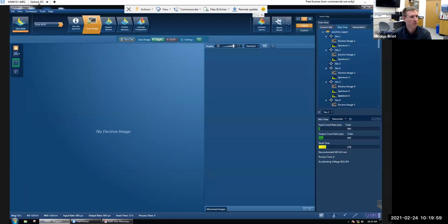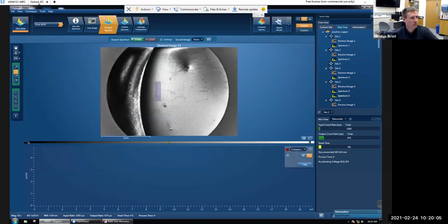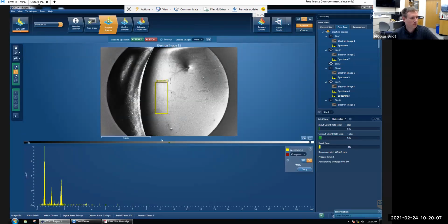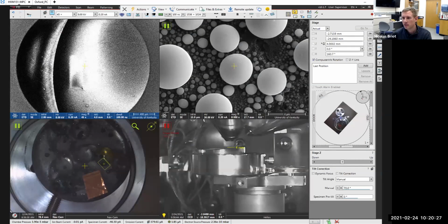Yep, I'm gonna just make a new spot. So let's just see what's going on here. I'm looking for that peak that's around. Silver is, what did I say? Yeah, it's 2.98. So doesn't seem like there's anything here. Okay, you go to another spot.